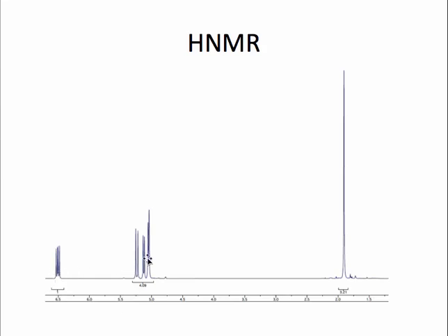We don't have to assign all of these peaks. We just need to know that there's 5 protons in that region. So while this is a rather simple example, it incorporates many of the things we want to think about when we're solving for a more complex structure. This is going to be progressing towards more complex problems, and then you'll be able to confidently do your own structure work.